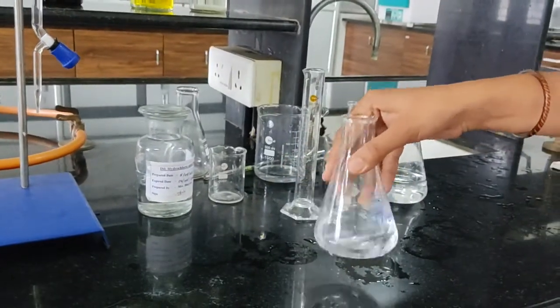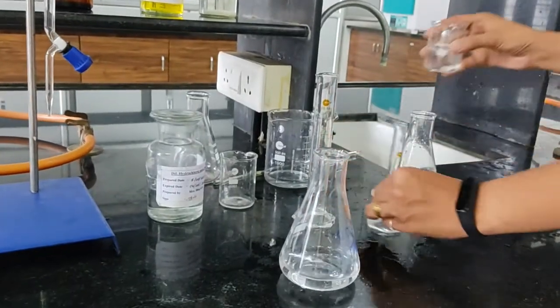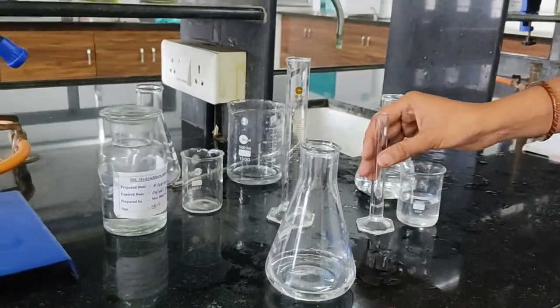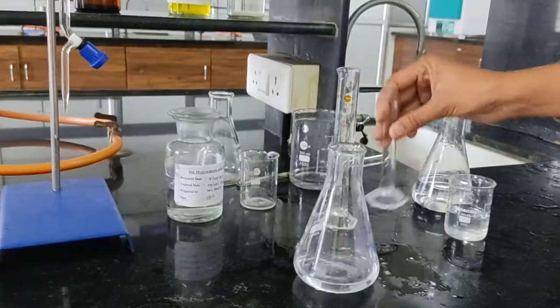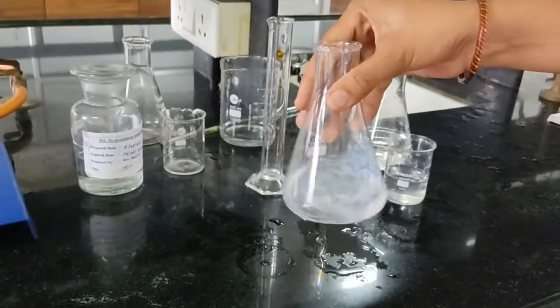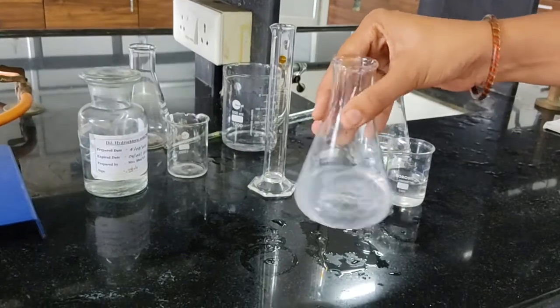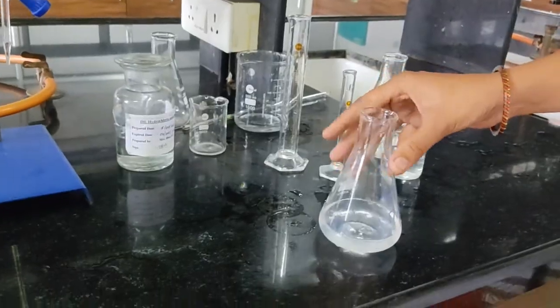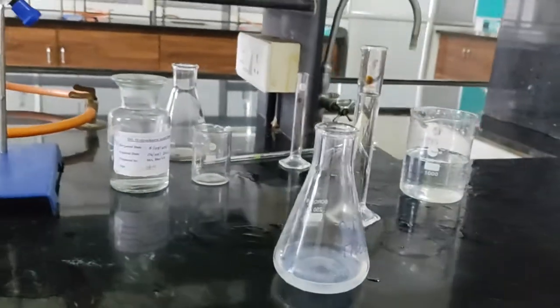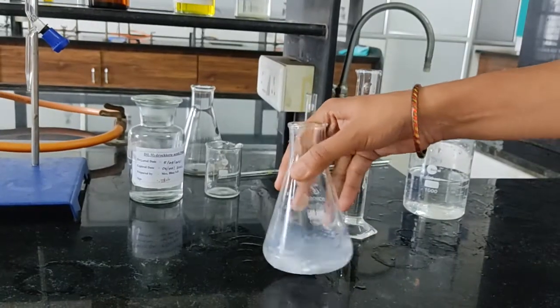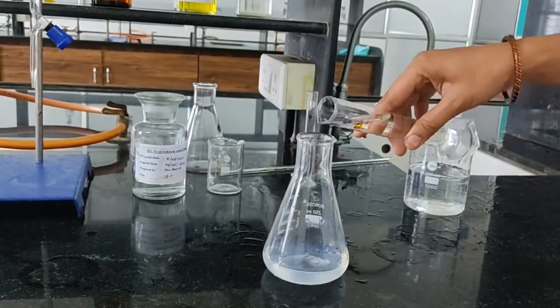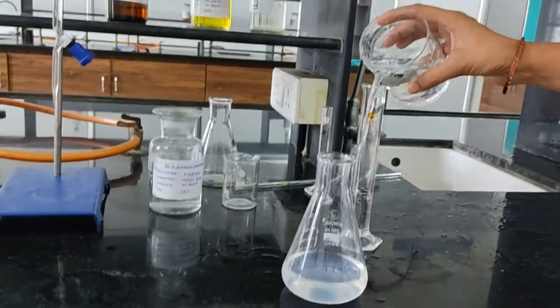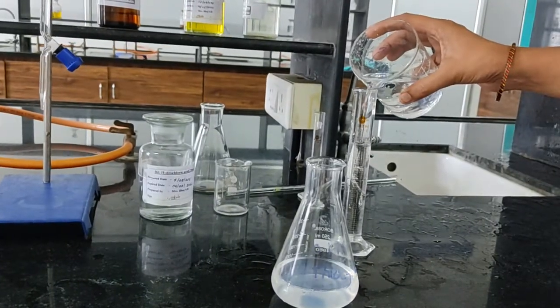To this solution we have to add 2 molar sodium hydroxide solution for neutralization. Add 2 to 3 ml of this 2 molar sodium hydroxide solution. Shake it properly and dilute this solution about 150 ml of water. Then dilute this solution about 150 ml of distilled water. So add 130 ml of water. So it becomes 150 ml of resulting solution.